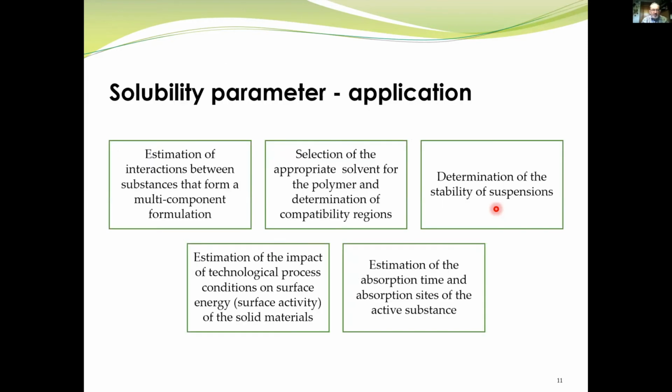And the solubility parameter may be applied in many tasks to solve many problems, both in the pharmaceutical industry or in analytical examination of, say, activity of adsorbents, and so we use it in different types.